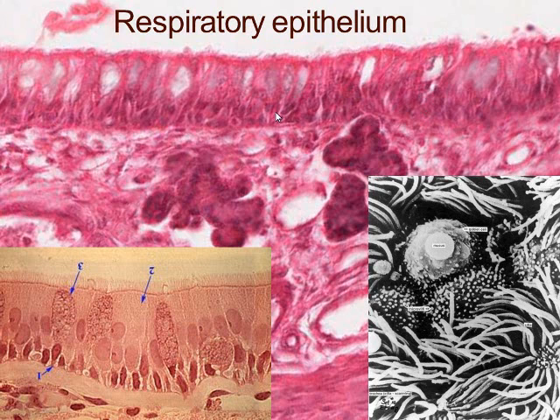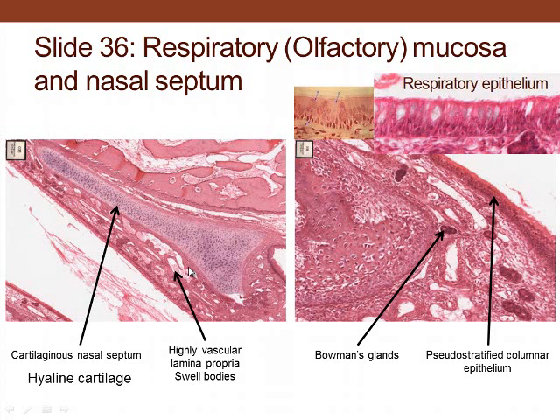So the respiratory epithelium is pseudostratified columnar epithelium with ciliated cells on its surface. And we can see the ciliated cells, and then we can see the mucous cells that are in there too, or goblet cells. You can see those here, goblet cells. Brush border, and this is not a brush border, this is a ciliated cells. You can see individual cilia, and you can see the basal bodies, which is the roots for the cilium to occur.